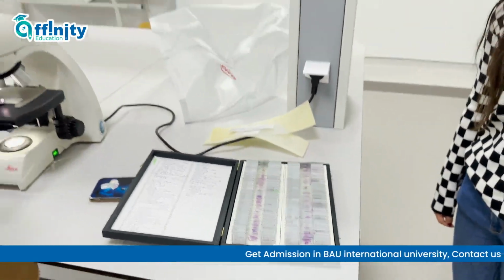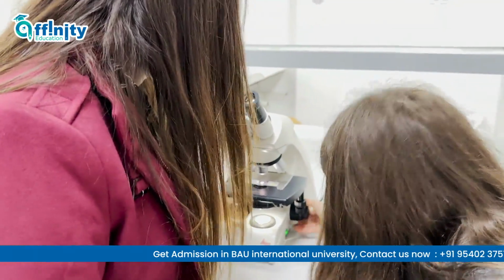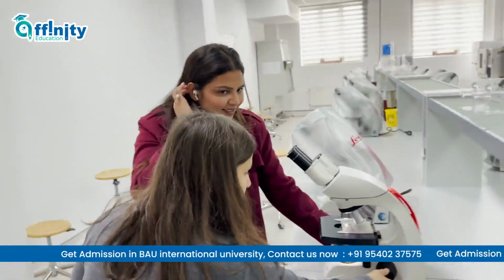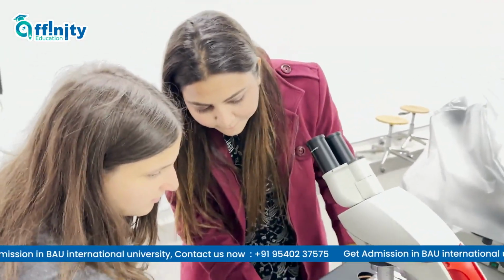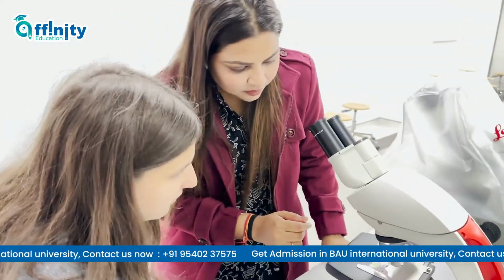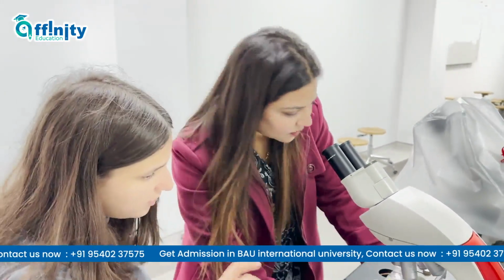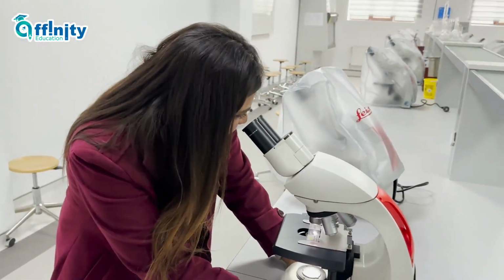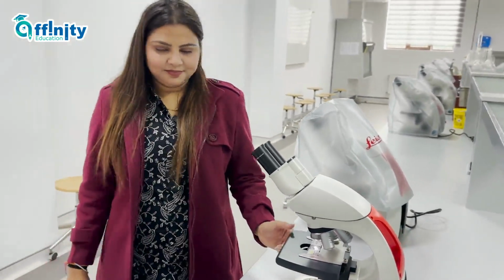Can you teach me how can? Yes, look, you should put your hand here and move for your. Each person has a different kind of vision. People have different kinds, so you should move like this and specify your vision here. Also, this one is for moving to different areas, like here and there. Okay. Here for vision. Thank you.